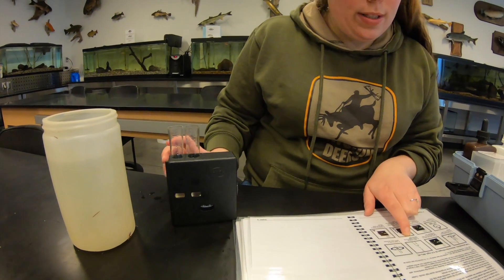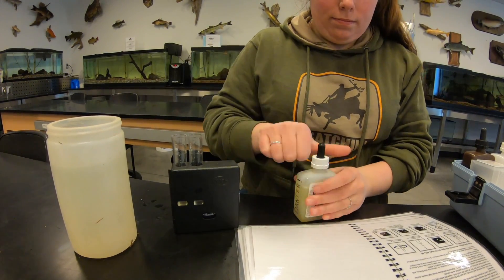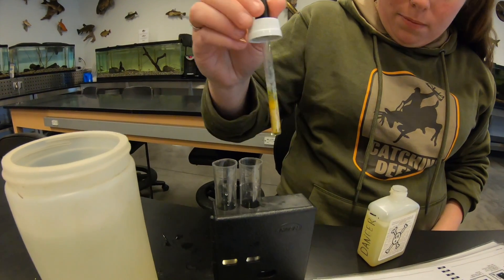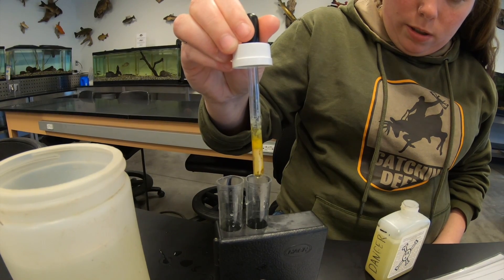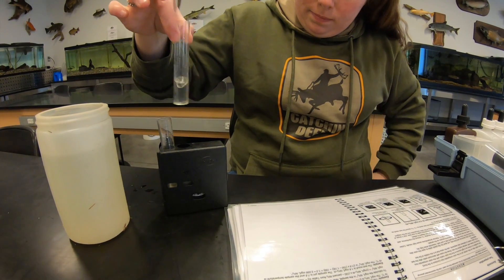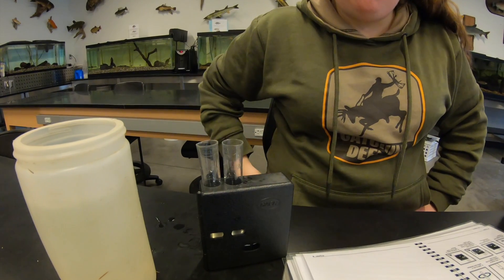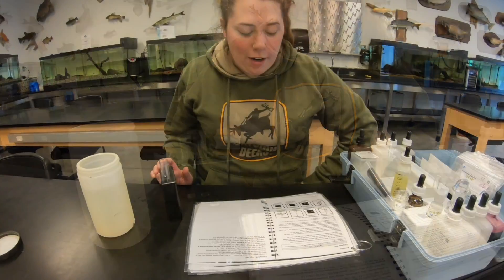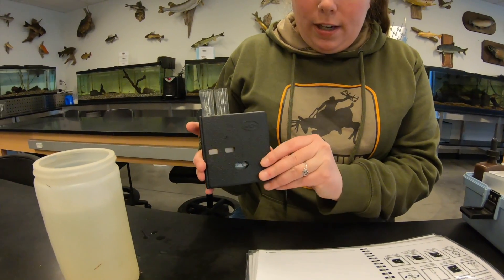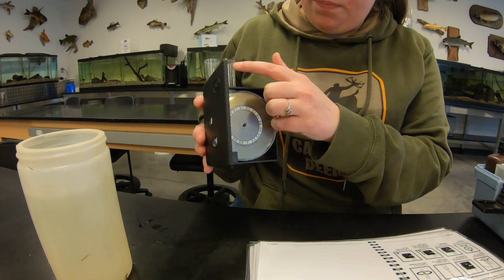We're going to add three drops of Nessler reagent to the second tube. You don't really want to get Nessler reagent on you. Three drops - one, two, three - into the second tube. Swirl to mix and a yellow color will develop. Then wait one minute and read the result within five minutes. We'll come back in a minute to see what happened.